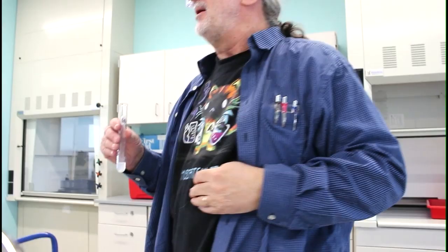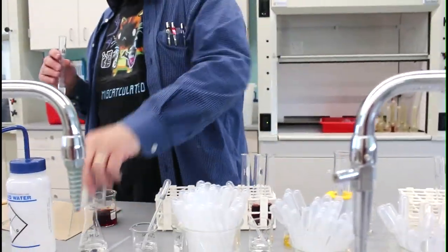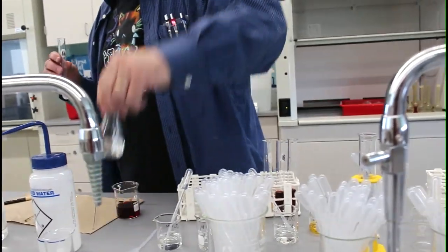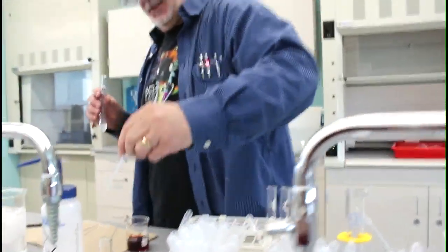And then the next step, add about 1 milliliter of 3 molar ammonia, NH3, aqueous.